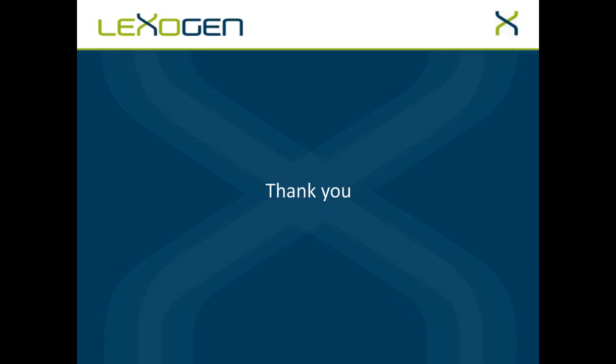If you want to extend it to more experiments, then you can clone this instance and install your own CloudMan environment, which of course then would be costing a bit more. However, you can also clone this SERV environment and get all the tools in a local Galaxy environment on your computer, on your server. So this is totally available, well documented, and for free.